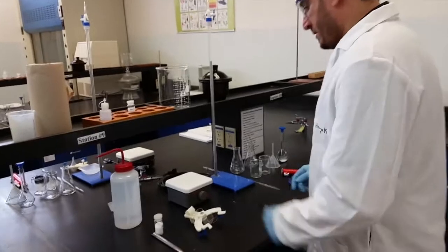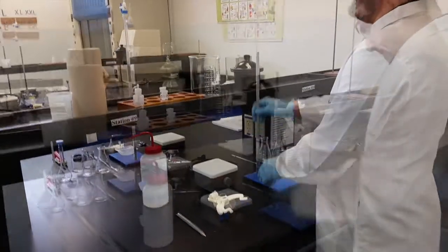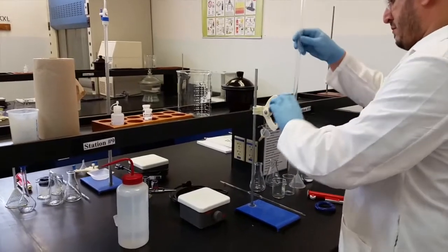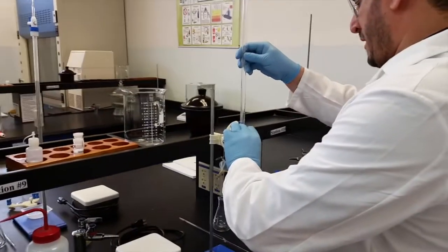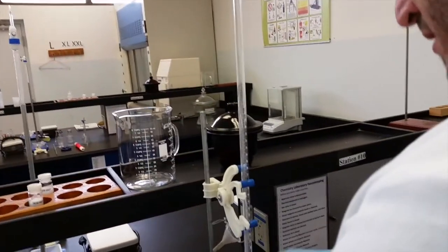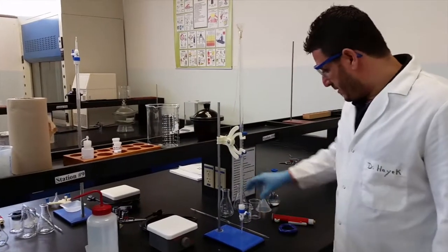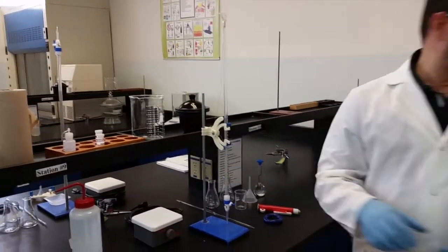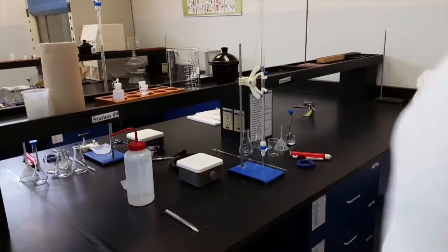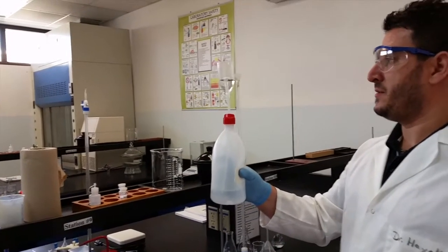The next step is to prepare my burette. When you put your burette, make sure that the graduation is facing you, and also that the stopcock is closed. In the burette, you will need to take 50 milliliters of potassium hydroxide.